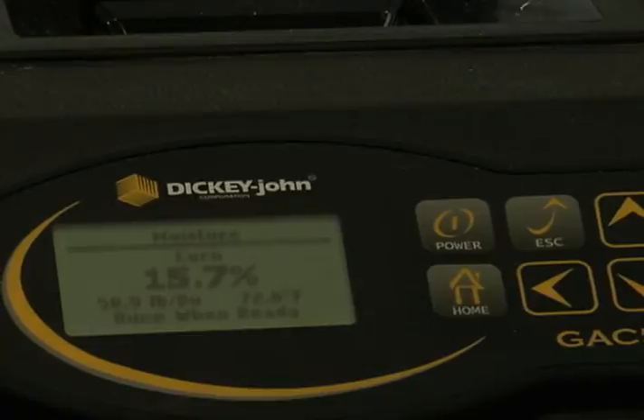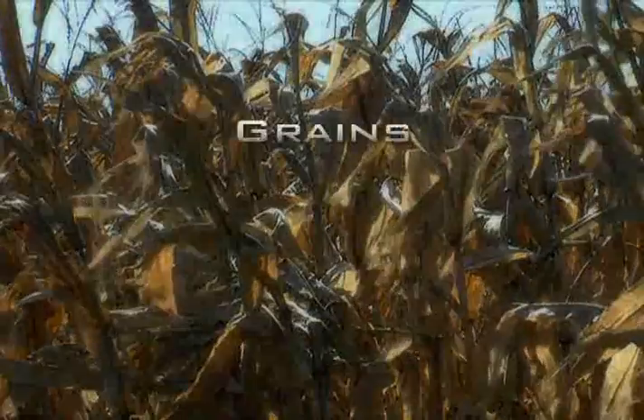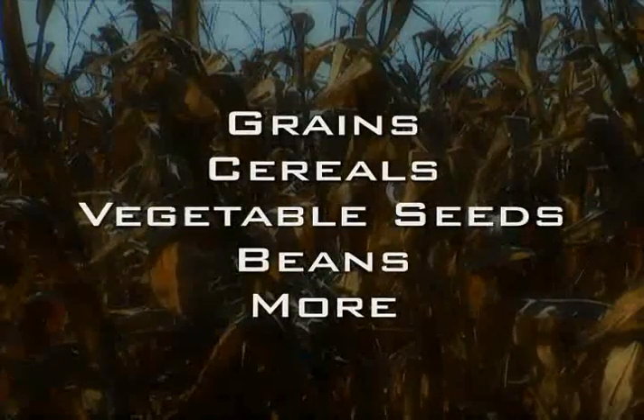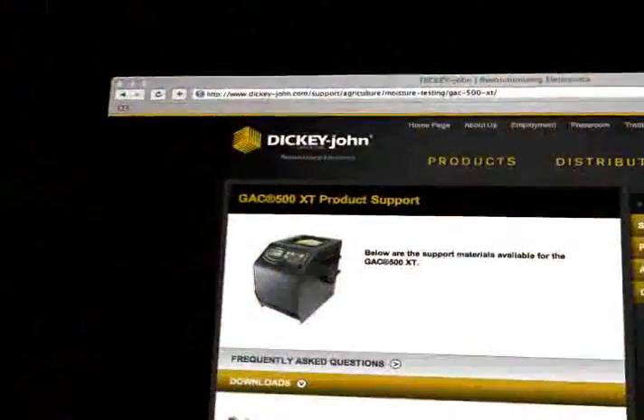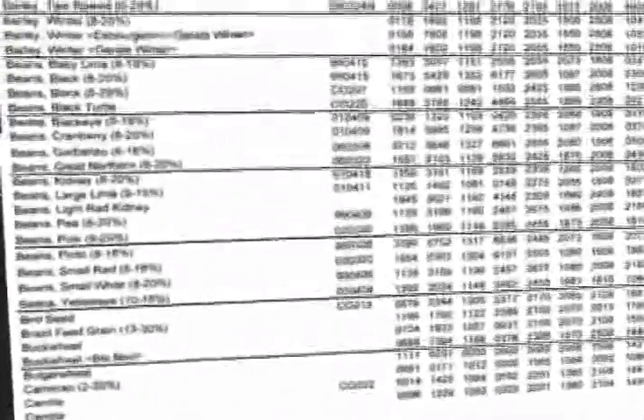With storage for up to 16 calibrations, the GAC 500 XT tests a variety of crops, including grains, cereals, oil seeds, grass seeds, vegetable seeds, and beans. To install additional calibrations, download them from the Dickie John website. Each GAC product comes with a calibration library of more than 450 different calibrations.